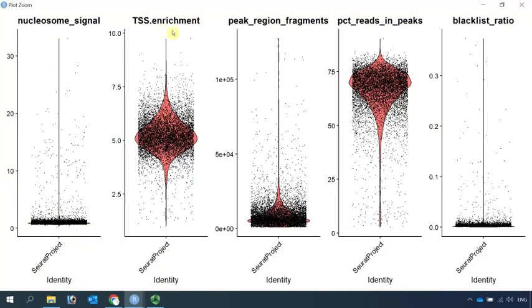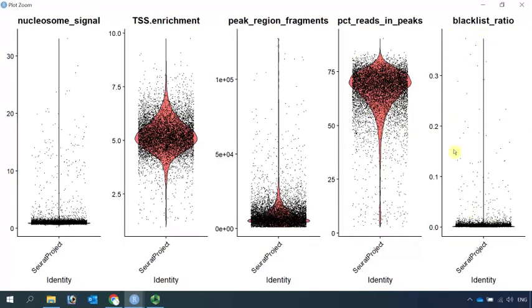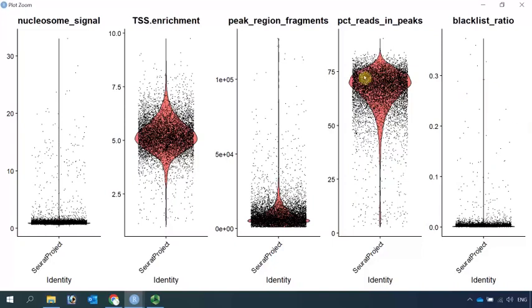For the TSS enrichment score, cells in this region are high-quality cells. And the total number of fragments in peaks, fraction of fragments in peaks. Cells with the high blacklist ratio should be removed because they are low-quality cells. You can use your own parameter to perform the quality control. Normally, we use cells in the high-quality region. But for today's demonstration, in order to produce the same cell pattern, I'm going to use the same parameter from the online tutorial.